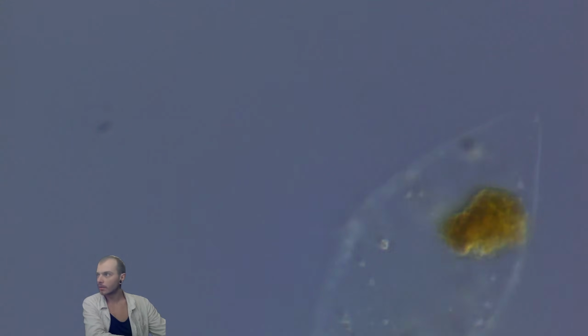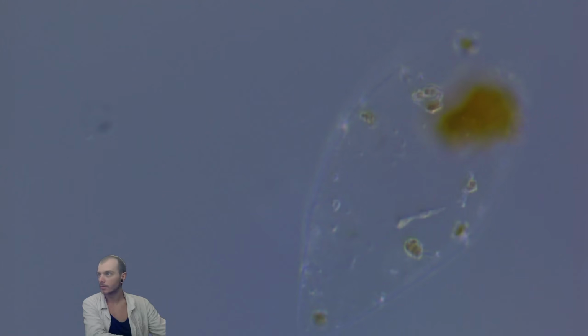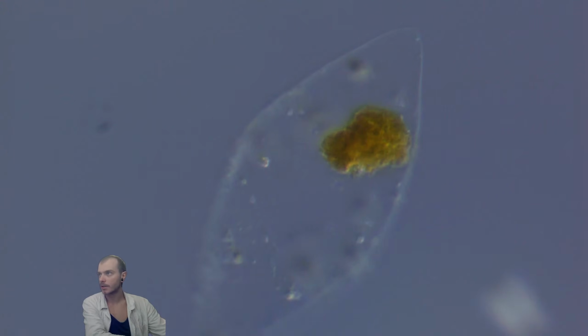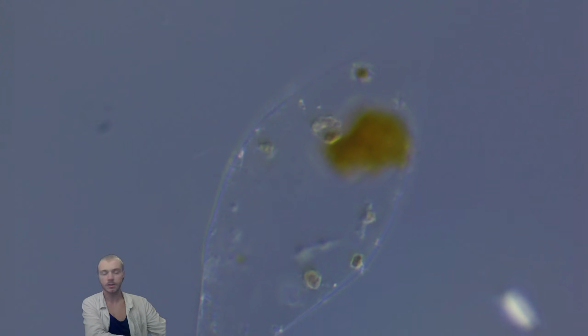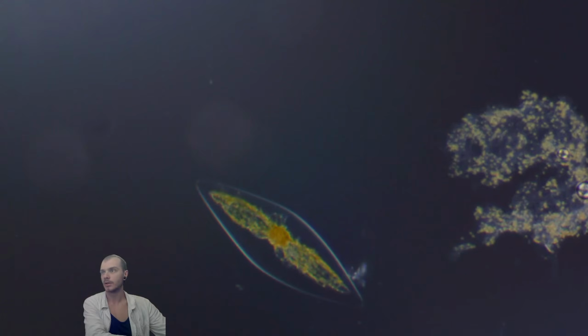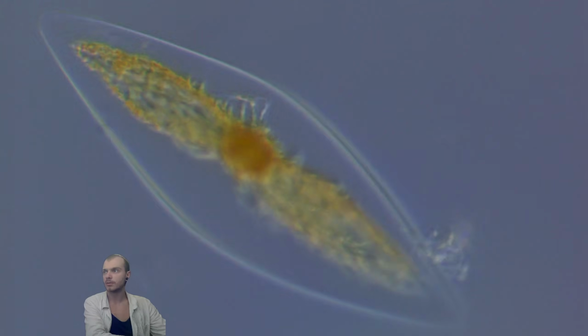This one is weird. Nah, this is not healthy too. Its nucleus doesn't have its shape. This is a broken one, another broken one. This is not healthy again. And no, this doesn't look good.